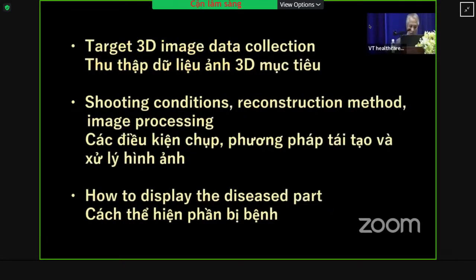The items shown on the slide are required to create a 3D image. Reconstruction and image processing are important after imaging. Few 3D images are designed in one click. Therefore, the original image is most important for 3D image, and it measures whether the imaging condition and the contrast enhancement condition are suitable for purpose.